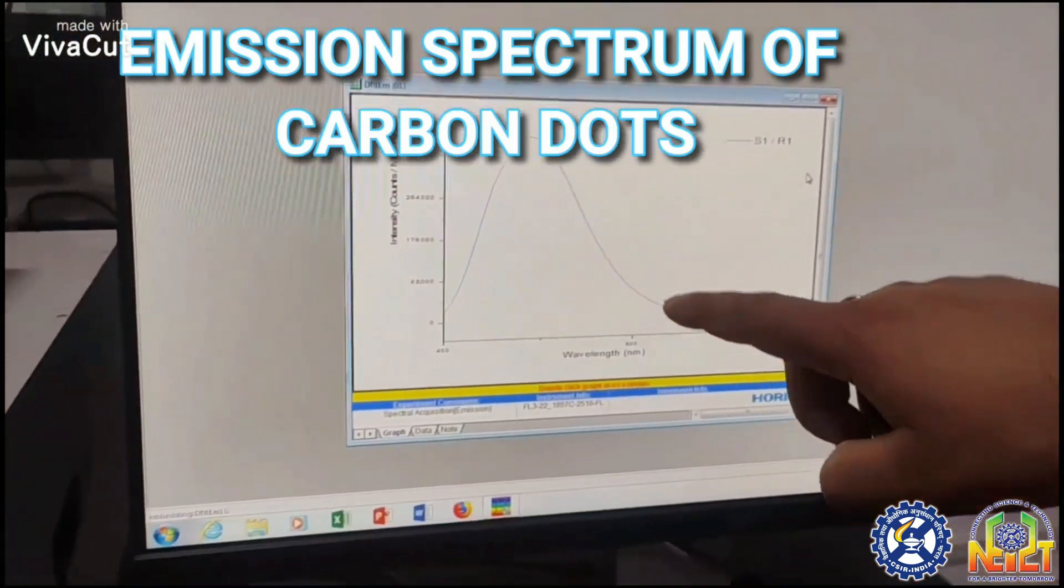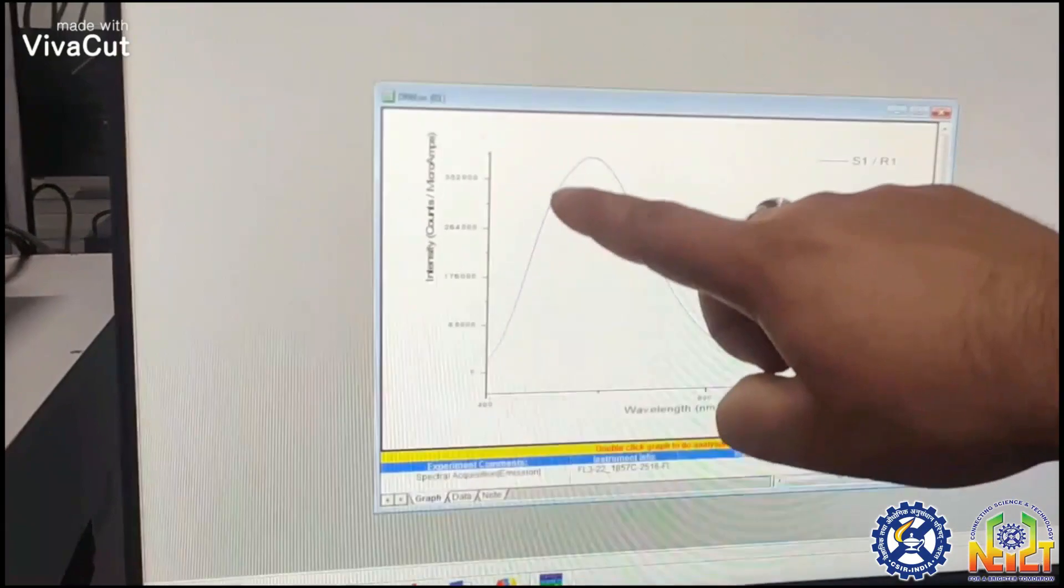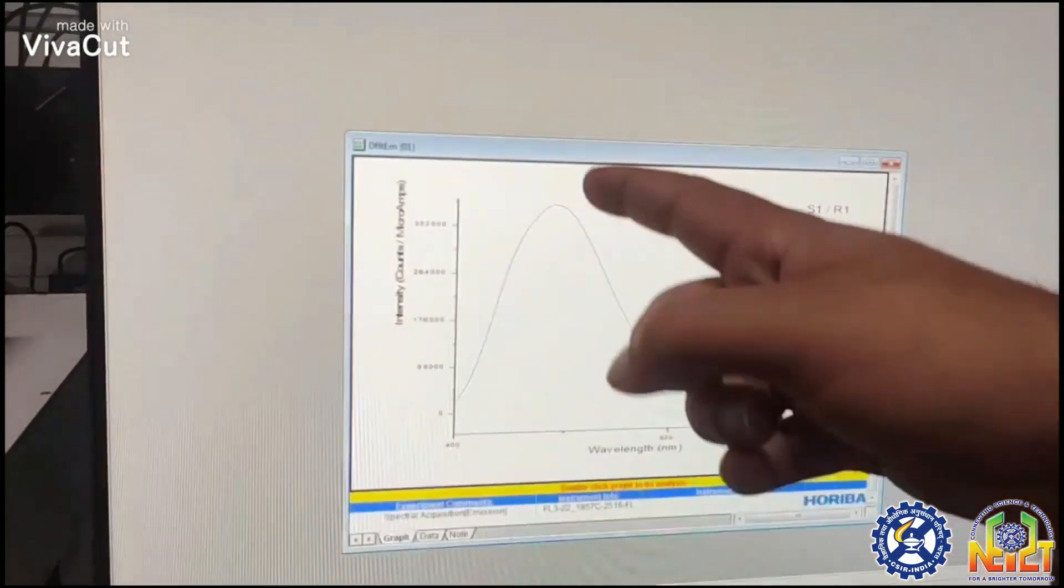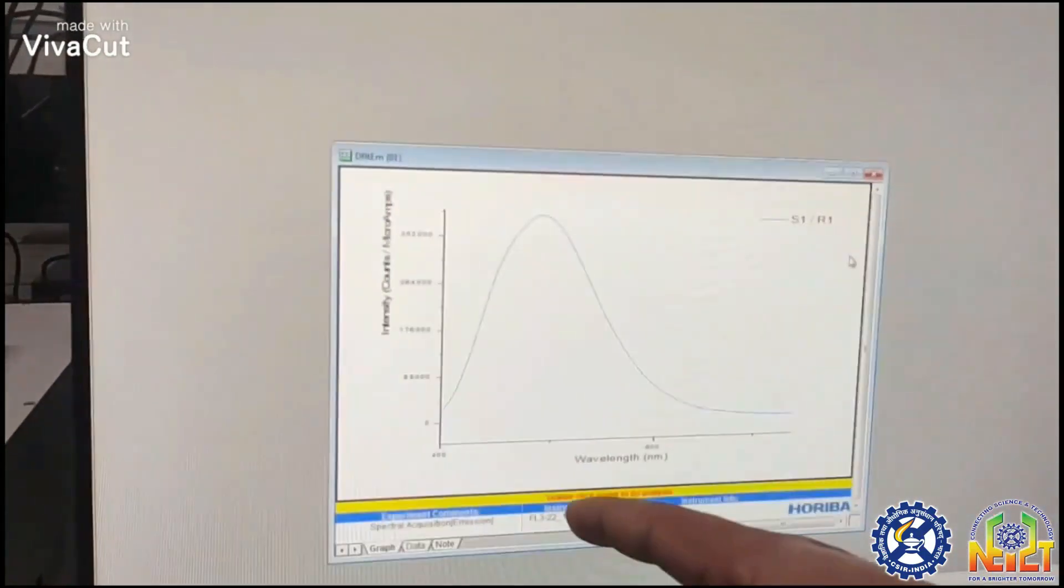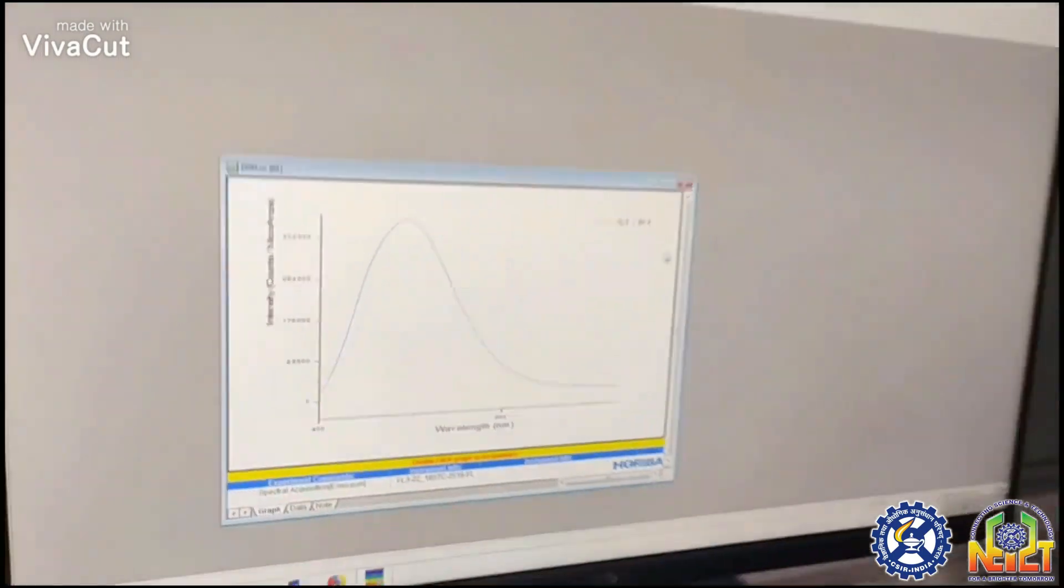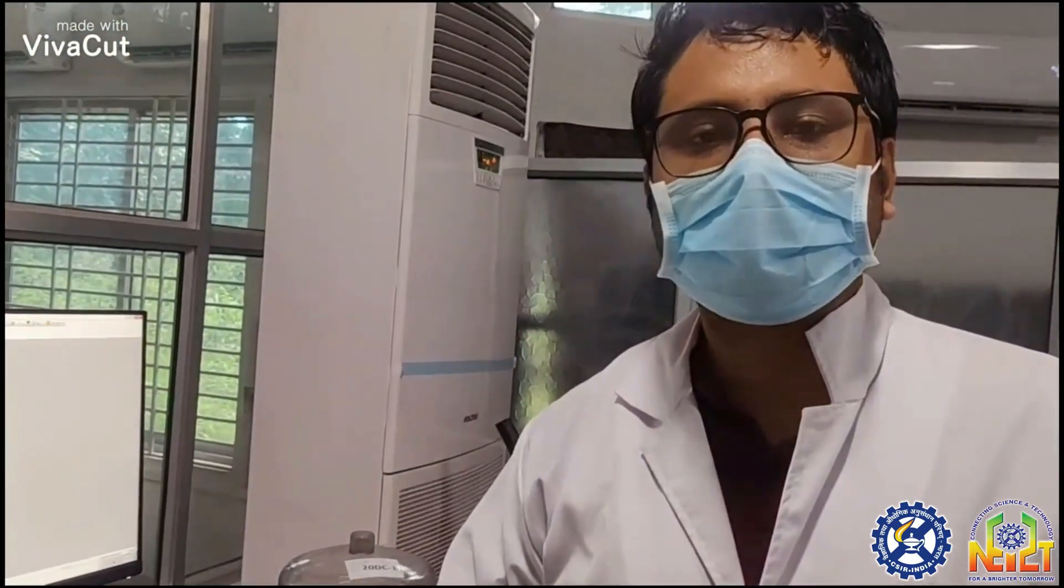This is the output spectrum. We can see light is emitted from 400 nanometers up to 600 nanometers, with the peak emission at 450 nanometers, which is the characteristic fingerprint of carbon dot material. In this manner, we perform the optical analysis of various materials by placing the sample in the compartment and obtaining the results.